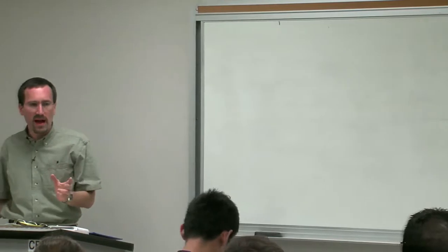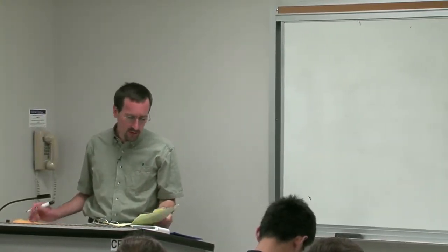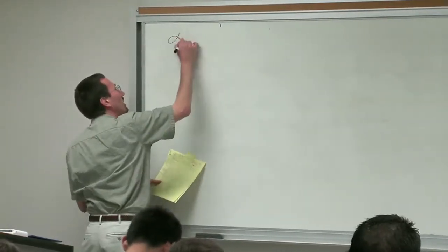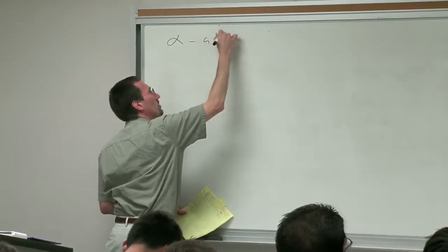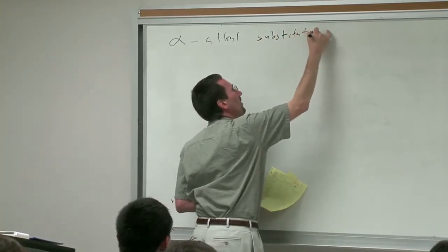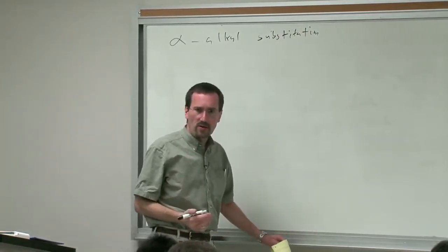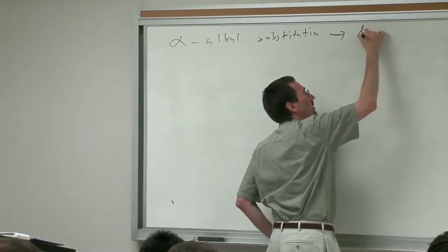So substituents have substantial effects, whether they're alpha, whether they're beta, whether they're gamma. And you can really see this. We're going to walk through this, and I'll give you some examples. So first, let's talk about alpha-alkyl substitution. And if I want to give you a general principle, in general, alpha-alkyl substitution leads to more downfield shifting.